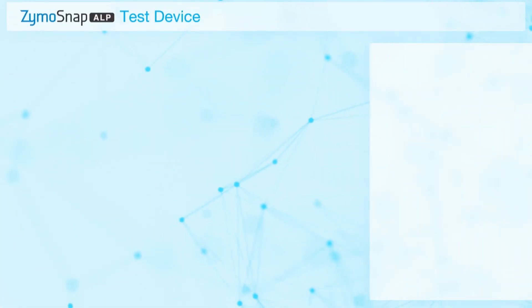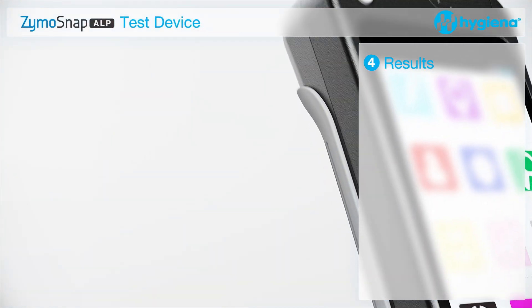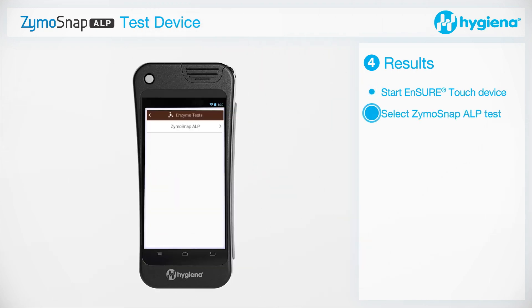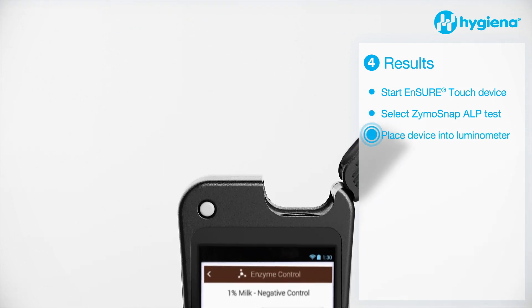Results. On the Ensure Touch, select the ZymoSnap ALP test and place the test device into the luminometer and run the test.